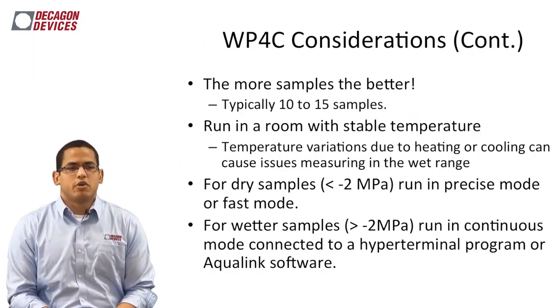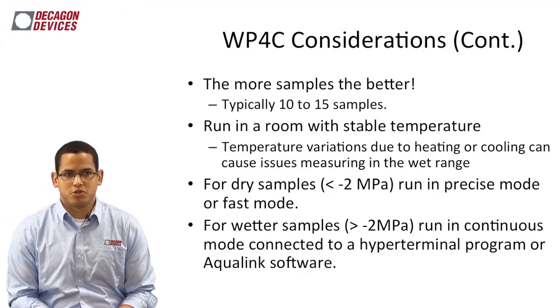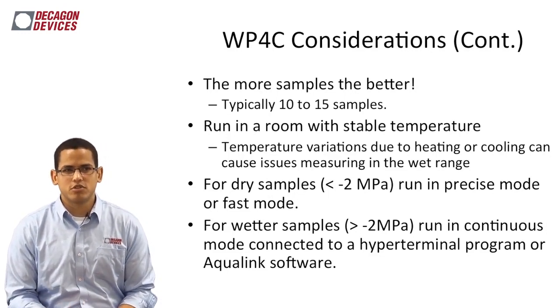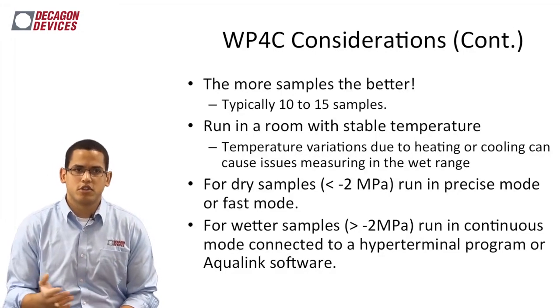So, some other considerations. I always feel that the more samples, the better. Typically, when we're running moisture characteristic curves, we use anywhere from 10 to 15 samples at different water contents to generate the dry end with the WP4C.